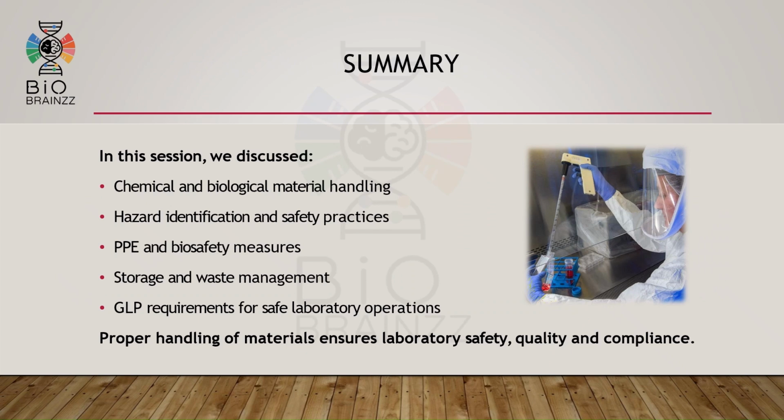To summarize today's session, we discussed the safe handling of chemical and biological materials. We understood hazard identification methods, PPE usage, biosafety practices, storage systems, and waste management procedures. We also discussed the importance of GLP requirements in laboratory operations. Proper handling of materials ensures safety, quality, and compliance in laboratories.